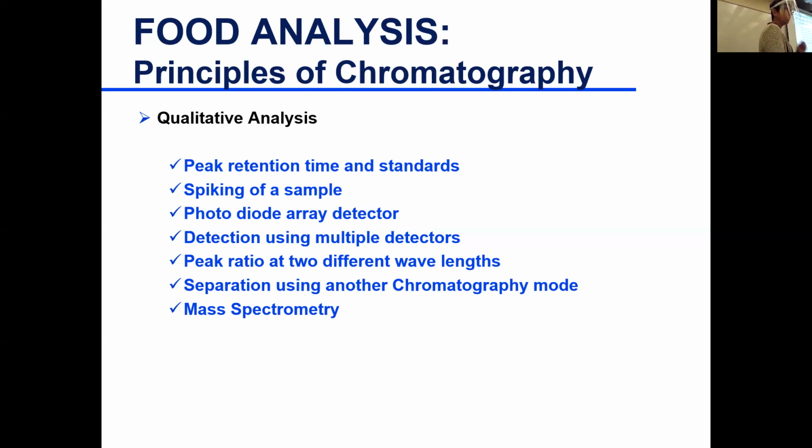But sometimes it's complicated. Sometimes you have very close retention times of the compounds. They are not separating. They are barely separating. Sometimes you have very nice sharp peaks, but there are two of them, and they're very close, like a few seconds apart. And you go, I don't know. I ran the standard alone. It's giving me somewhere here. I don't know which is which though. This is my standard. This is my sample. This is my standard. I don't know which is which.